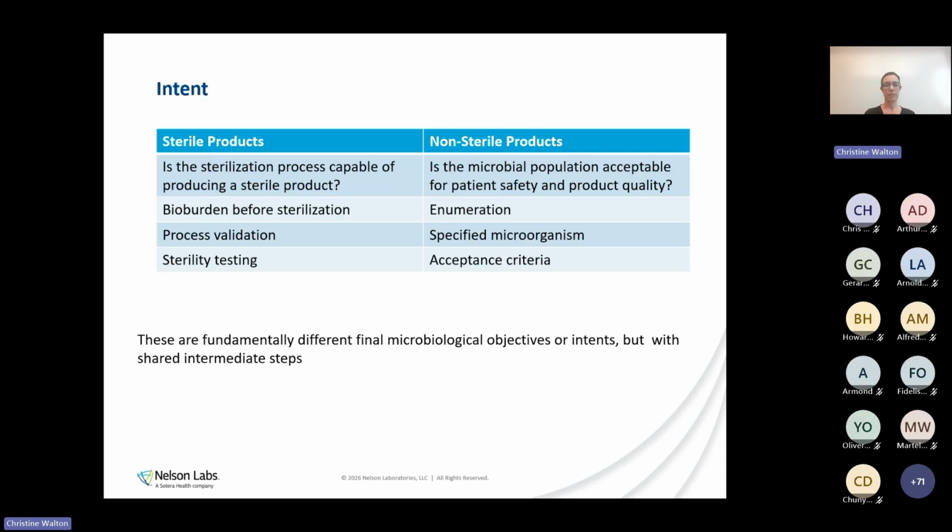ask for specified microorganisms. We'll get into a little later, some not unheard of to have regulatory bodies actually ask for specified microorganisms on a sterile pathway, and some of the risks that can fall in there. And then the end testing of a sterility test versus non-sterile products, which are really just trying to show that they're meeting an acceptance criteria. So again, intent can be quite different, but that doesn't mean they're not sharing components through the process, which again can lead to that overall kind of confusion between pathways.